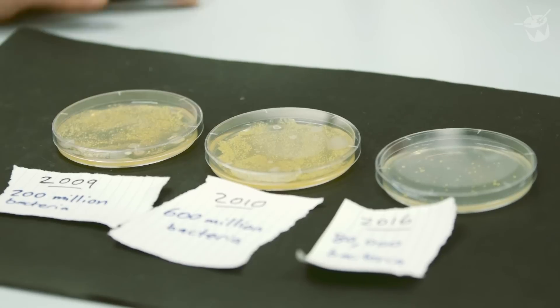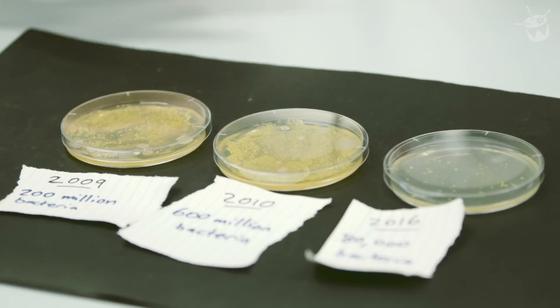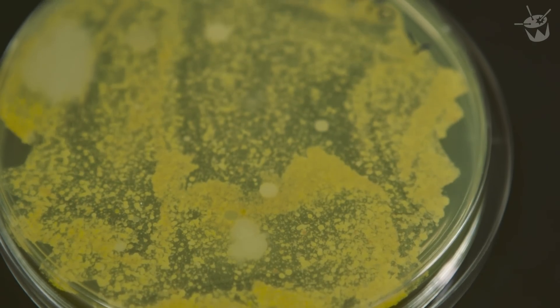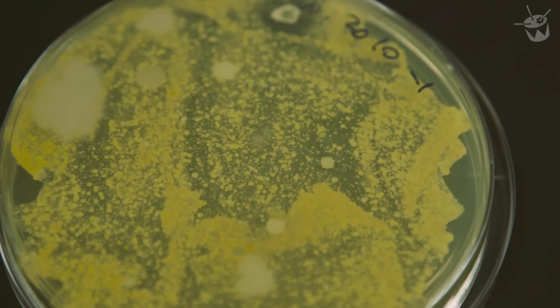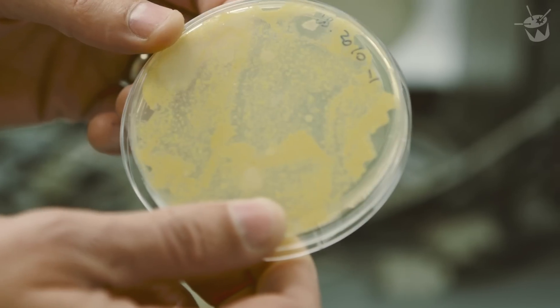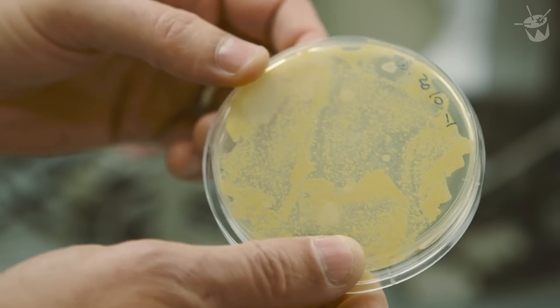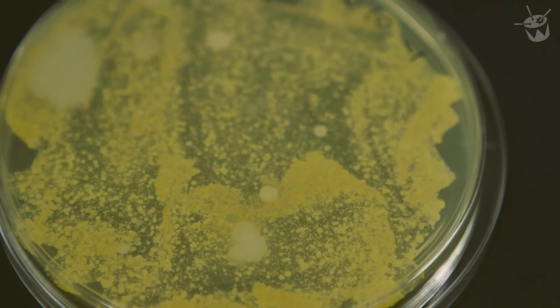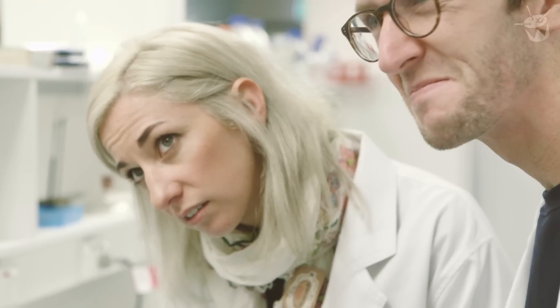So we've got our plates here, and as you can see they've grown a lot of bacteria. Veronica, yours was by far the most disgusting — just jokes, your one wasn't too bad. We've got a wealth of different bacteria. Mostly these yellow ones — the light yellows, I think that's micrococcus, and that guy's not particularly harmful. There's some other guys here, like these white spreading ones — that's probably bacillus, which is a soil organism.